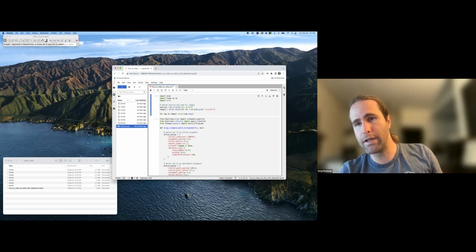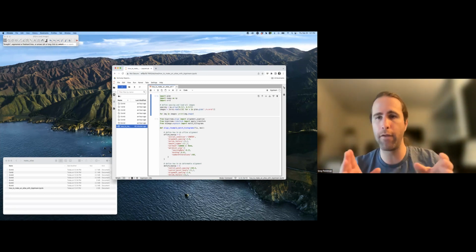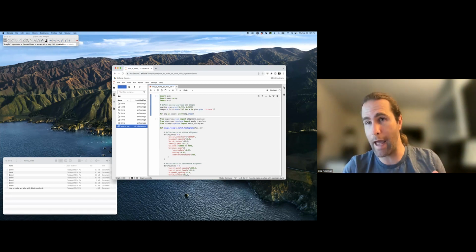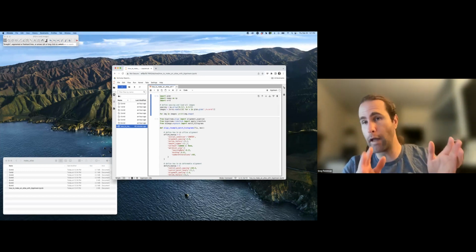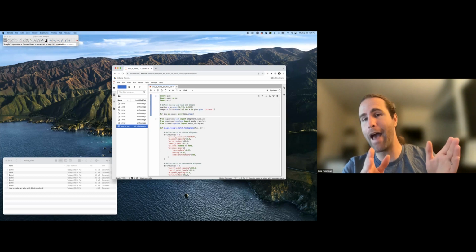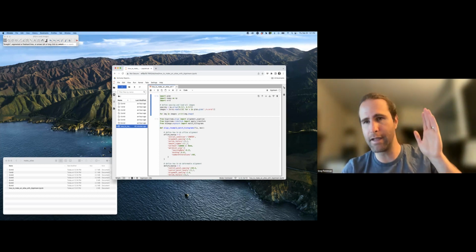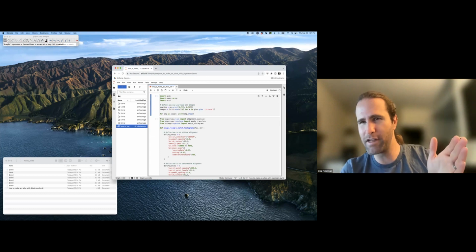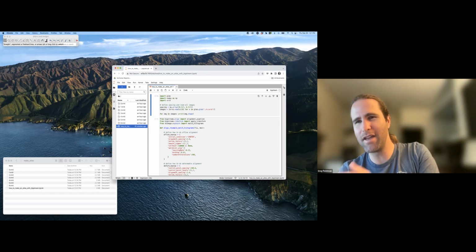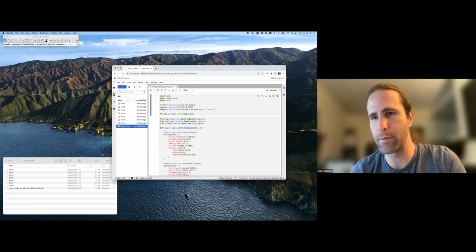So what I'm using here is histogram matching, and this requires two images as input. You have a reference histogram, and then you have the image whose histogram you want to change. The algorithm changes, in a nonlinear way, the histogram of one image so that the CDF, the cumulative density function, of the two images is identical. So it maps, say, intensity 1 from image A to some other intensity from image B, such that the cumulative histograms of those two images are as close together as possible.